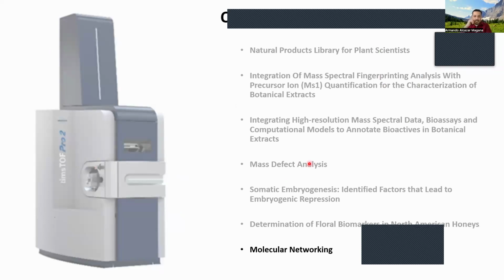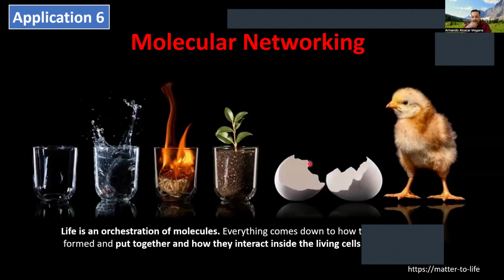So finally, I just want to talk a little bit about why we like molecular networking so much. Basically, what we see in the mass spec is all disconnected ions, right? But when they are in a living organism, they are connected. They are in pathways, they are communicating.